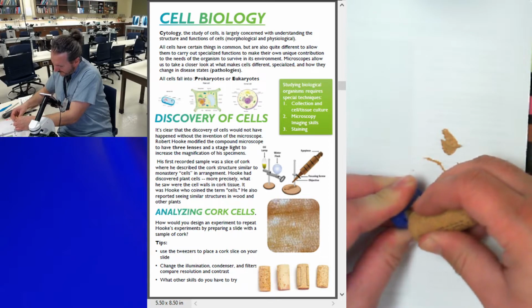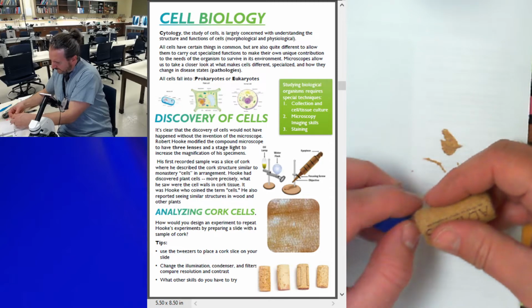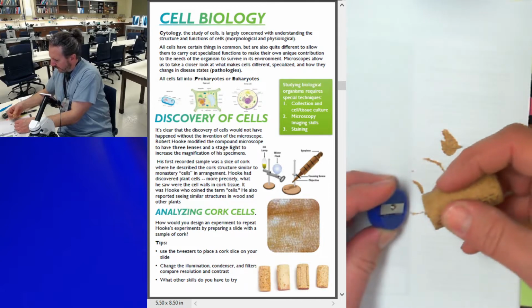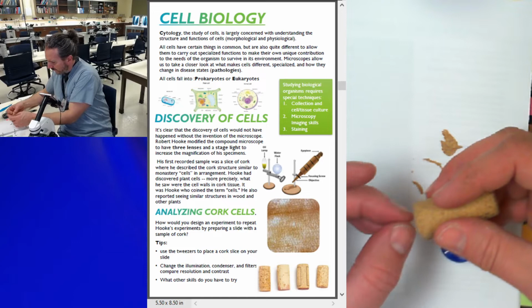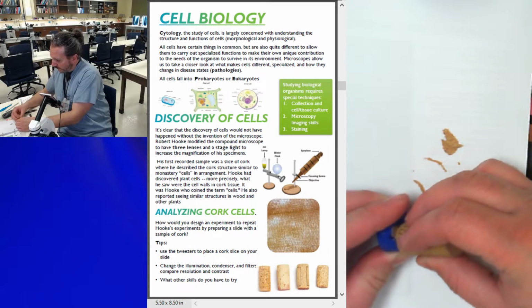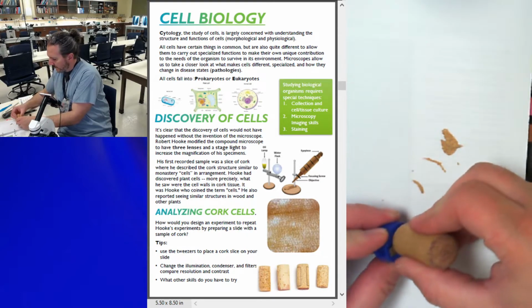So I'm sliding, wiggling back and forth, getting a little sliver off. And I'm hoping you're doing the same thing with me, because you're going to use your own pieces. Okay, I spun some, you can see it's kind of curling off. Man, that one might be just perfect. So thin. Okay, so I just spun it a little bit, put the edge of the cork in, brought it over and spun. Let's go back the other way.